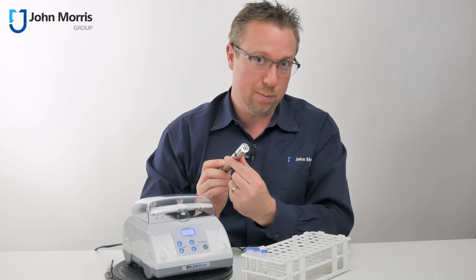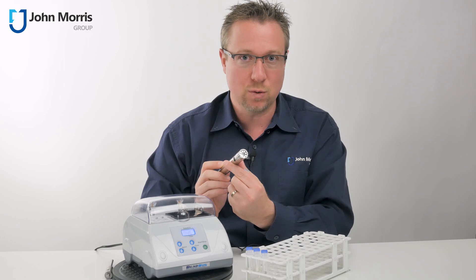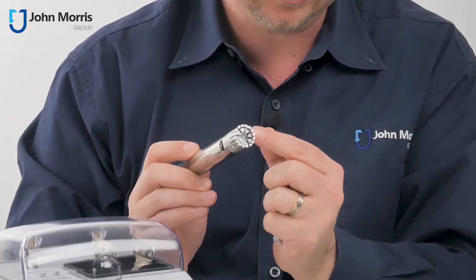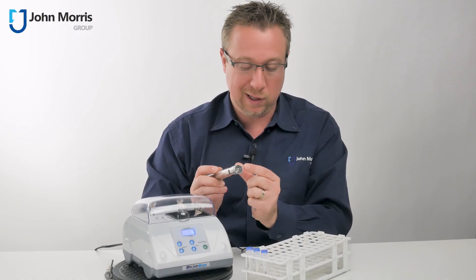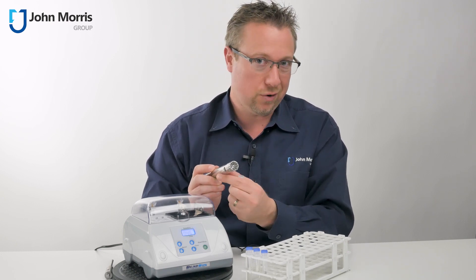But the problem with using something like this is it's very hard to clean. It's very hard to separate samples from one to the other, particularly if you're working with DNA or RNA or some fine component, because it's so hard to remove the last sample completely from the new sample. So you find yourself spending more time cleaning in between runs than you do actually using the device. Plus they're incredibly noisy.